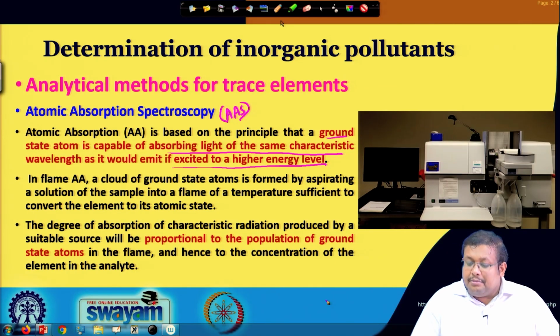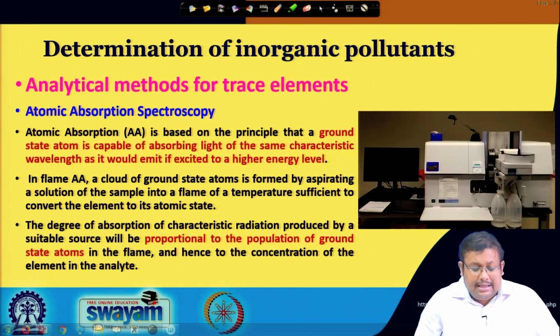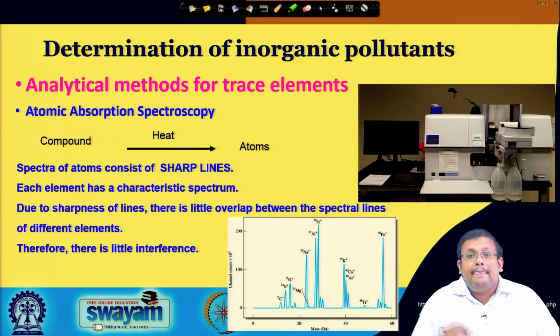You can see here this is an atomic absorption spectrometer and there are different types of attachments with it. We can attach the auto sampler for automatic sampling, we can attach the hydride generation to enable it for measurement of arsenic and other elements, specific metalloids. So, this is a basic form of atomic absorption spectrometer. Now, let us move ahead and see the principle.